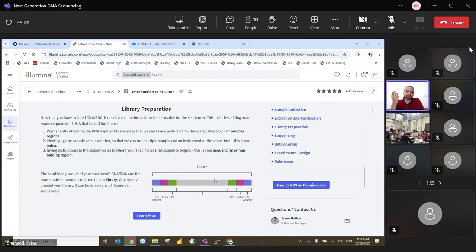Then you also have enzymatic methods to do the fragmentation of DNA. Enzymes are, you can say, kind of like us. They're lazy. They will try to break the DNA where it's easier. They will not go into the difficult regions to break.